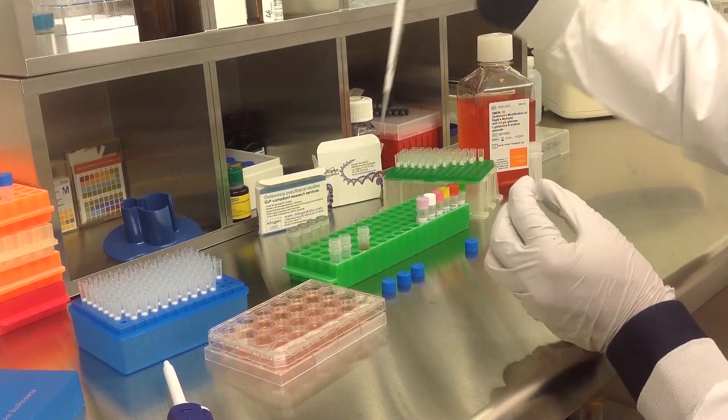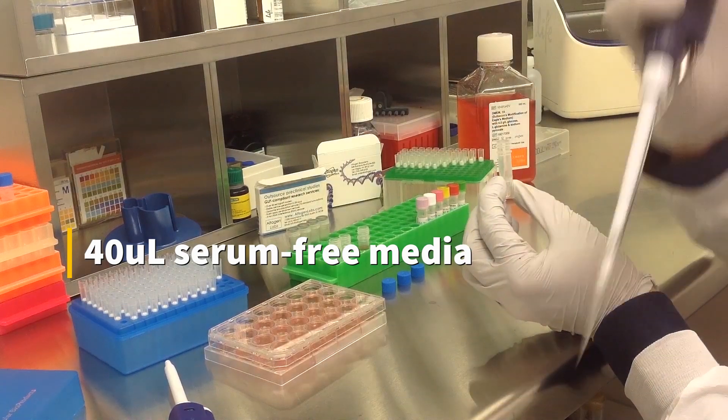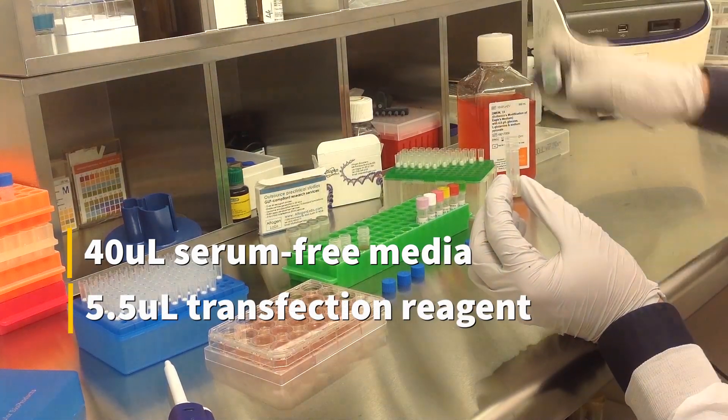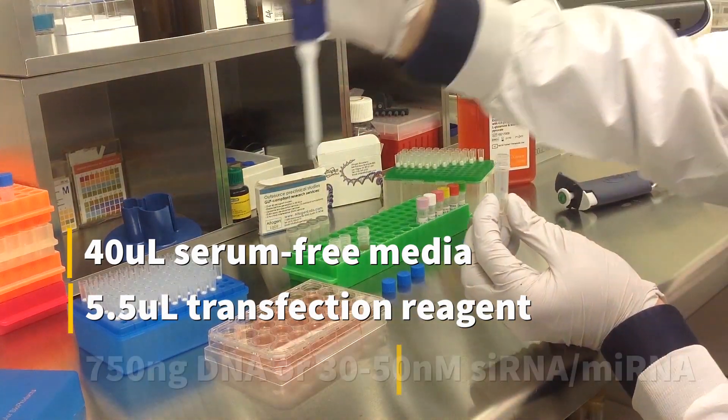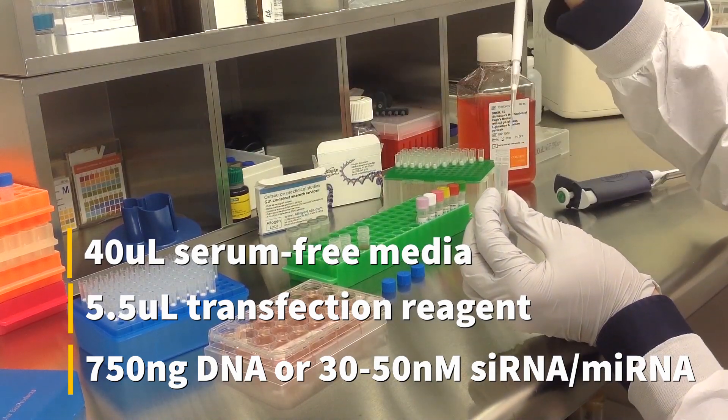To prepare the transfection complex, mix 40 microliters of serum-free medium, 5.5 microliters of transfection reagent, and either 750 nanograms of DNA or 30 to 50 nanomolar siRNA or microRNA.